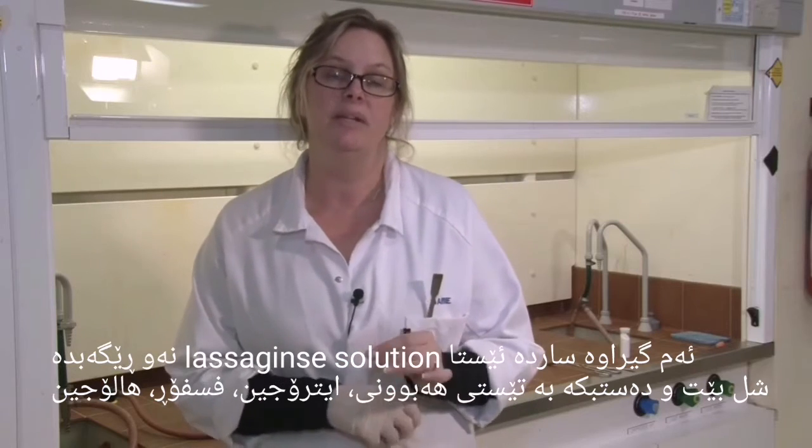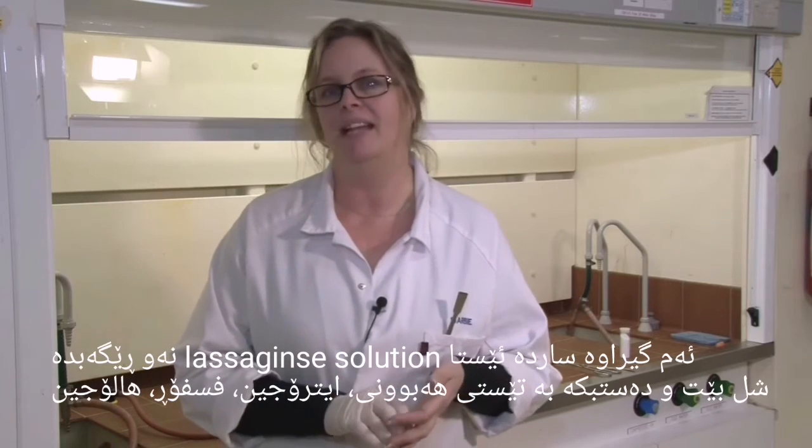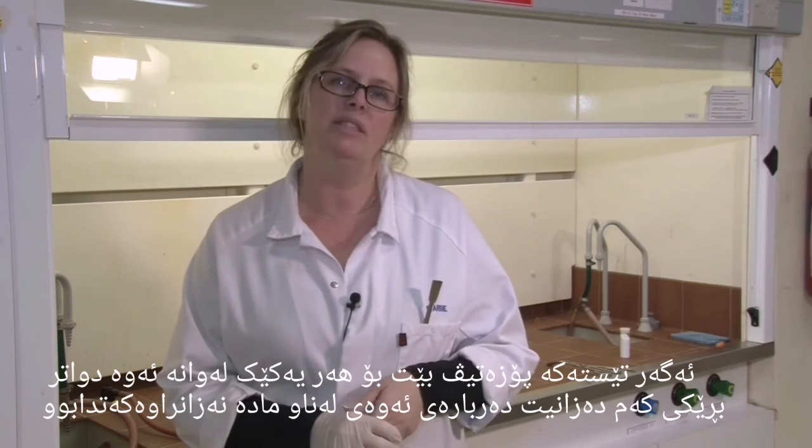Take the Lassaigne's fluid and carry out tests for nitrogen, sulfur, and the halogens. If the fluid tests positive to any of these tests, you'll know a little bit more about what's in your unknown.